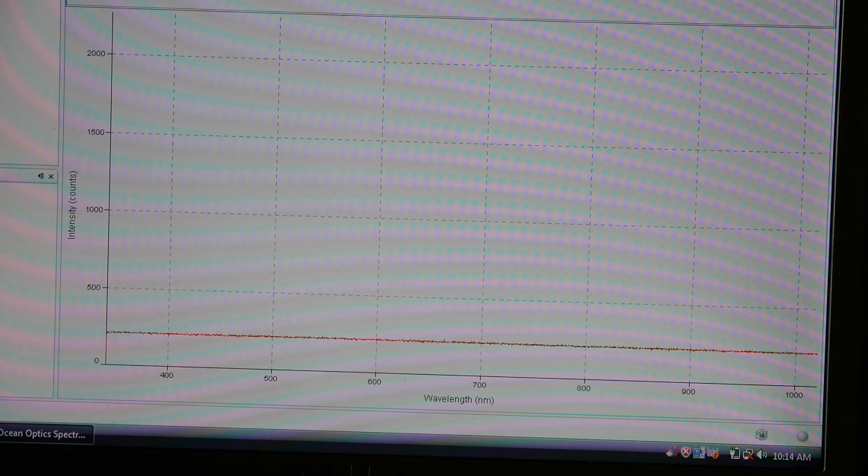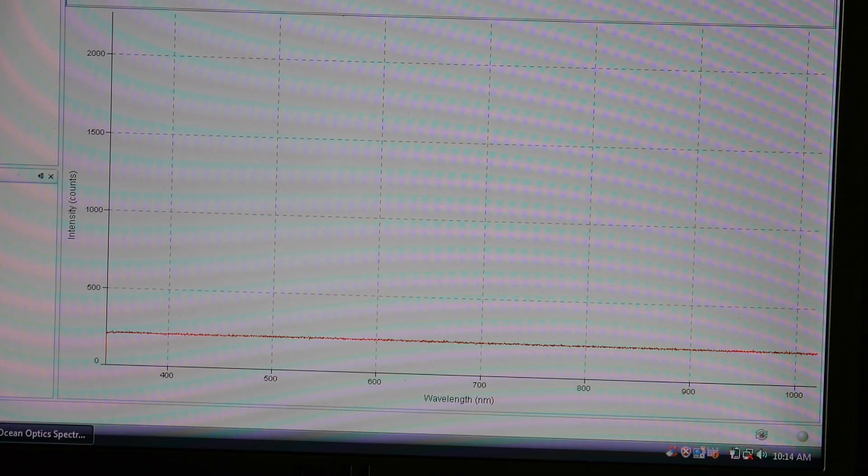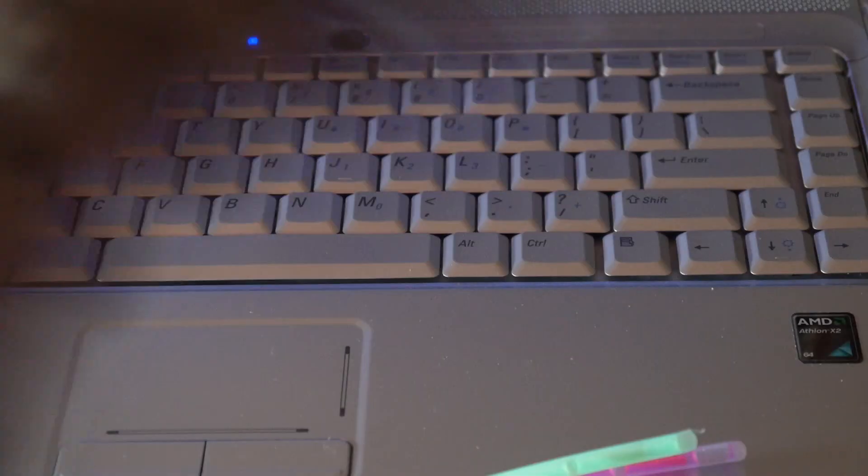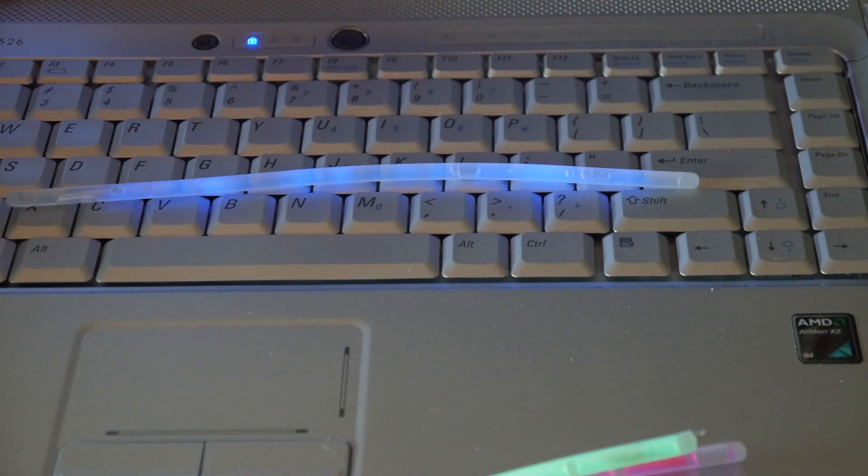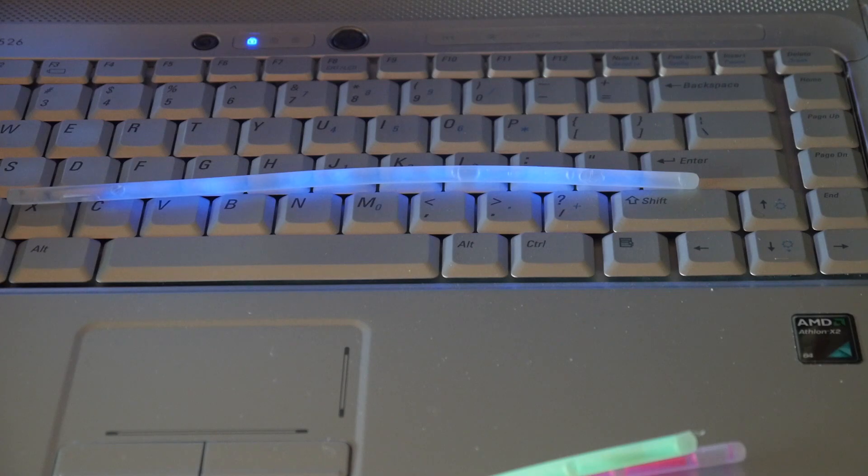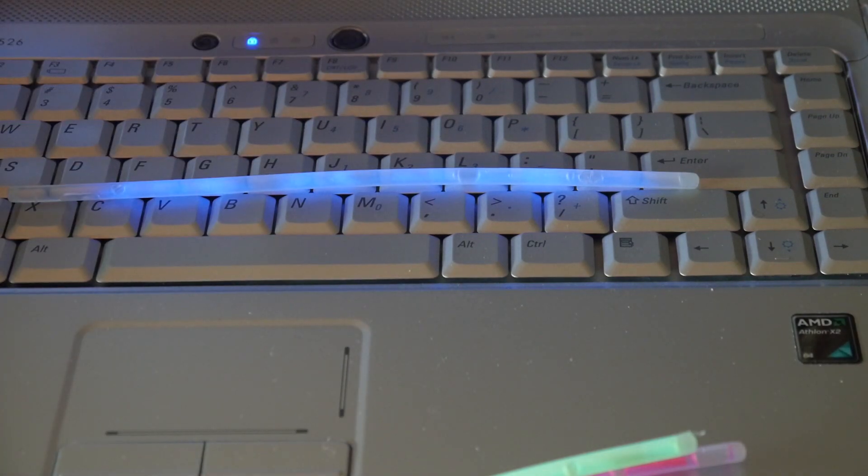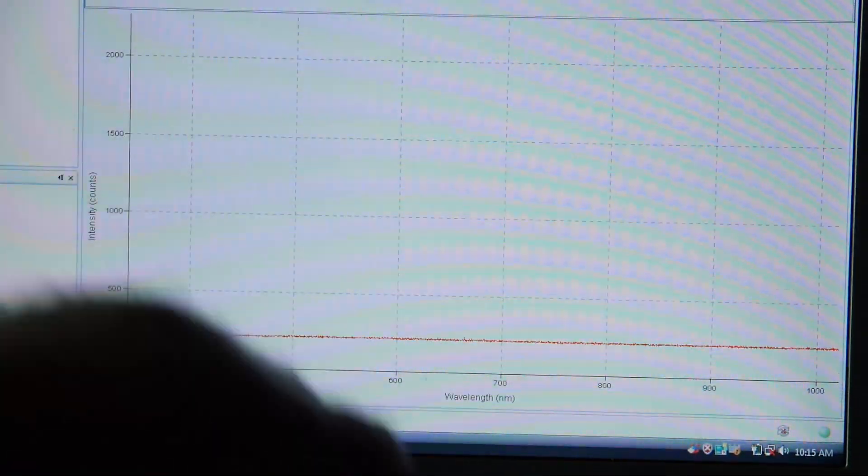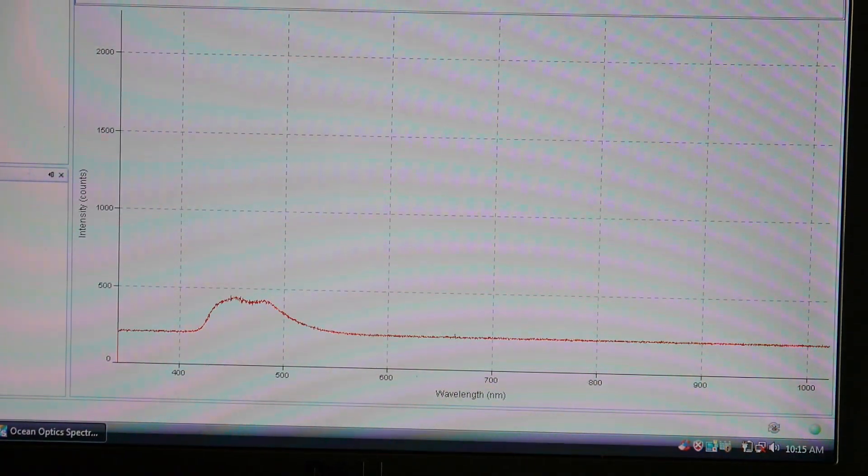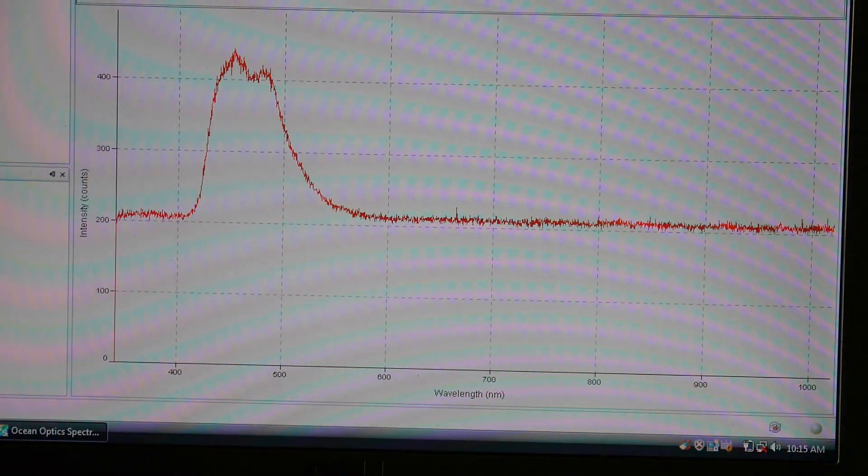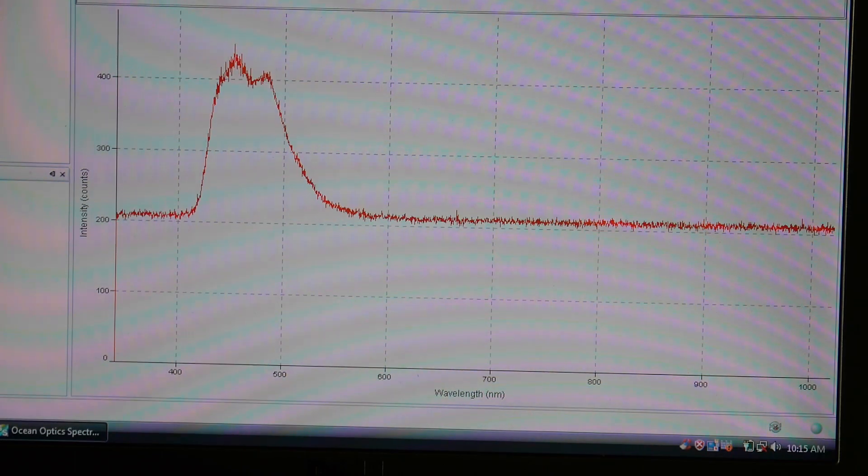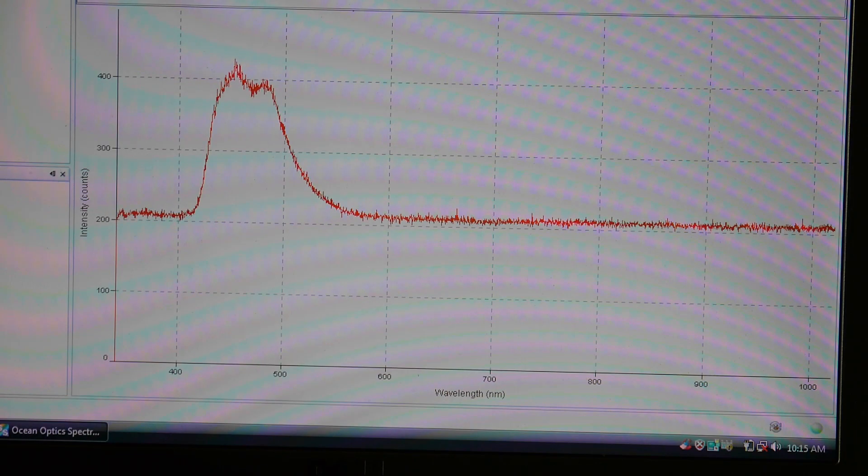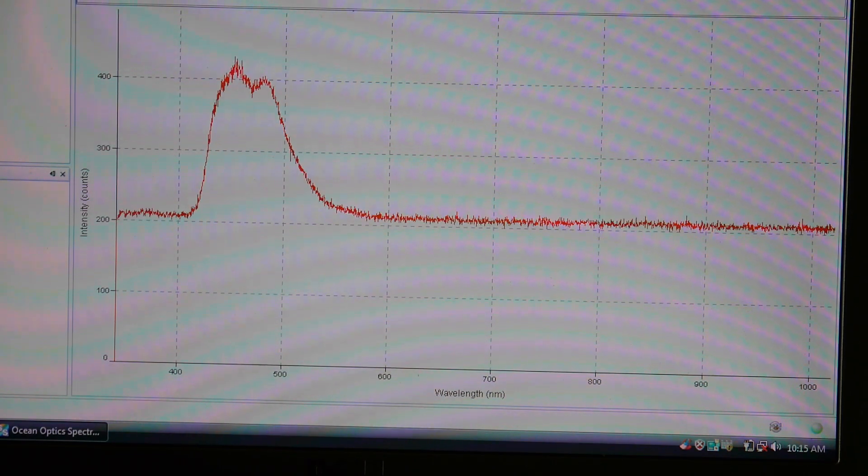Let's see. We have one that appears to be clear. So this one seems to be clear. So let me break it and shake it up. So it's a blue color. So I'm going to say, remember we saw that blue that was kind of around 400 to 500 and it kind of had a flat, flat top? I bet you that's what this chemical is. So let's take a look at that. And yeah, I think so. I think it's the same chemical. So so far we've seen a blue chemical, a green chemical, a yellow green chemical, and a red chemical. That's the blue chemical.